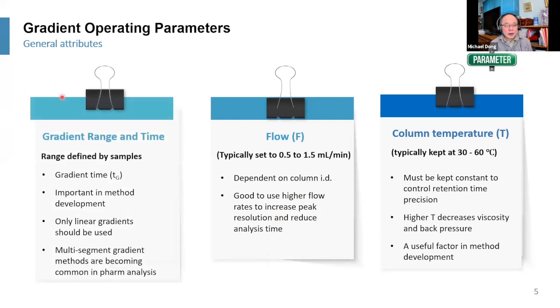And then today we talk about some of these things: gradient time. Why do we use linear gradient? And why do we want to use multi-segment gradient? Right? So I'll give you some examples.